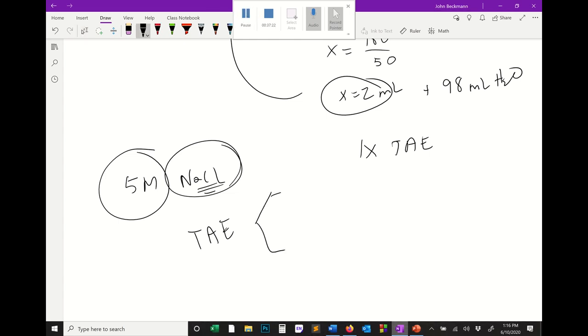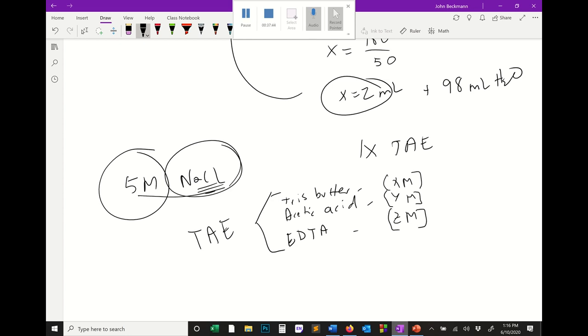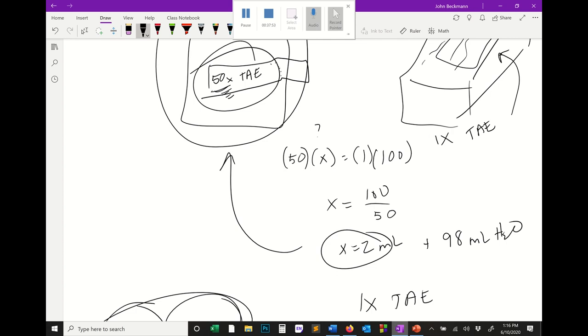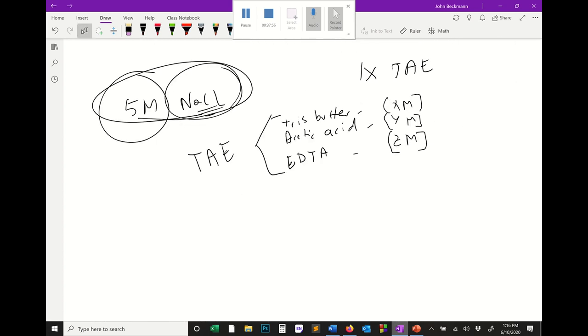TAE is a solution of 3 separate things: tris buffer, acetic acid, and EDTA. These 3 different things are all at different molarities, X, Y, and Z molarities. So you can't just write it like you would write 5 molar sodium chloride. What we write is 50x TAE, and that solution is not used at 50x, it's used at 1x. So there needs to be a dilution of 50x to 1x, at which point we then use it.